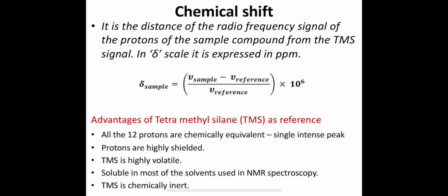Chloroform-D1 is the most commonly employed for PMR, and other commonly used solvents for organic compounds are CCl4, CD3CN, that is acetonitrile, where the 3 hydrogens are replaced by deuterium, DMSO-D6, and C6D6. So these are some of the solvents especially used in PMR.